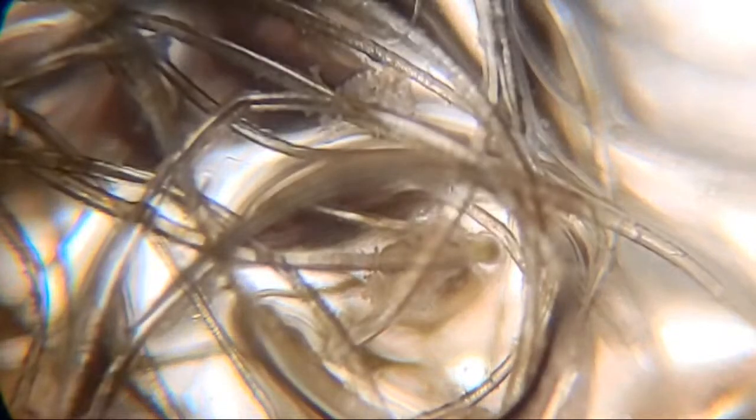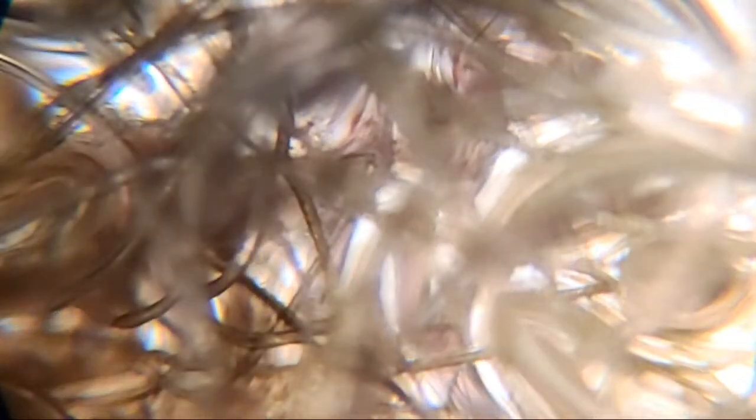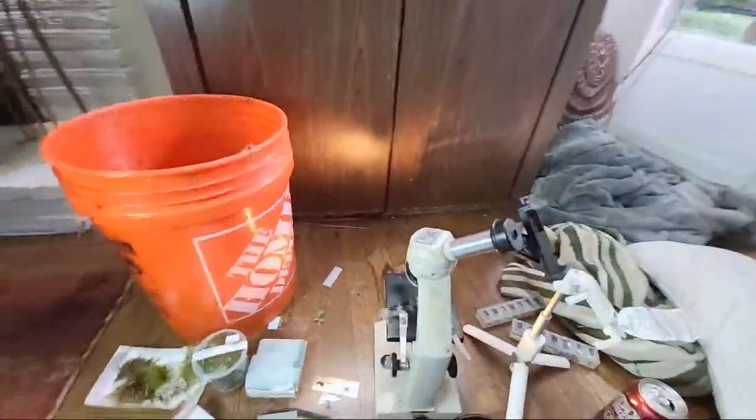It's really interesting how intensely covered the older sample is in fungi roots, mycelia and hyphae — or mold — compared to the new slides. It's a different species too, just looking at it you can tell. There's another little critter making movement at some level, but it's decided to burrow underneath all the other junk. This is the oldest slide — oh, what is that? A planaria? I see a shadow of some sort. It's some sort of worm that's eating detritus.